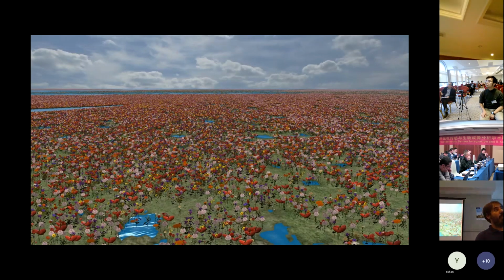This uses a particular graphics technique that I didn't go through because of time, which is MIP mapping. While we have the humongous image, we don't want to always use it, because if you're zoomed out you cannot see the fine detail.